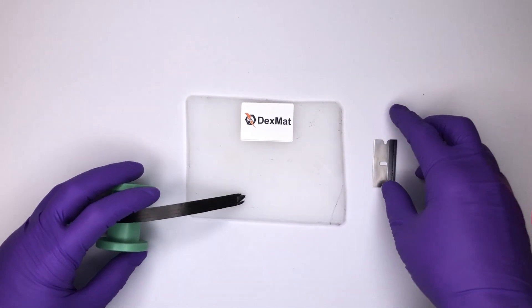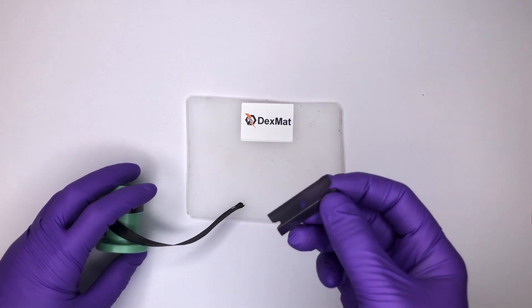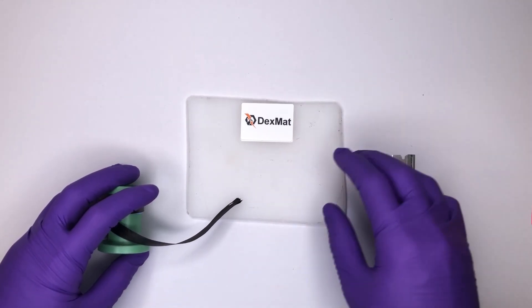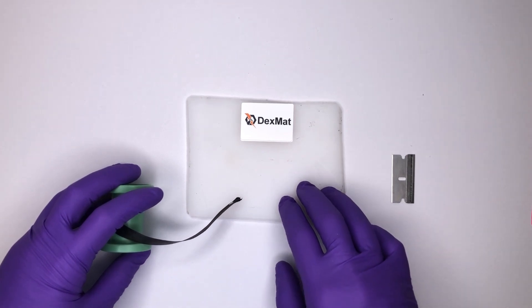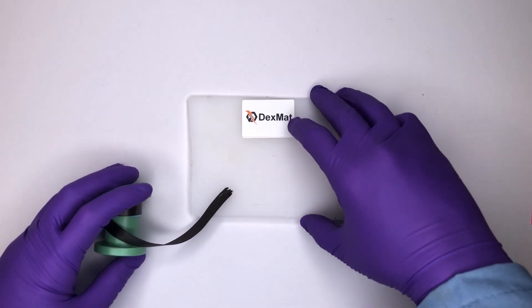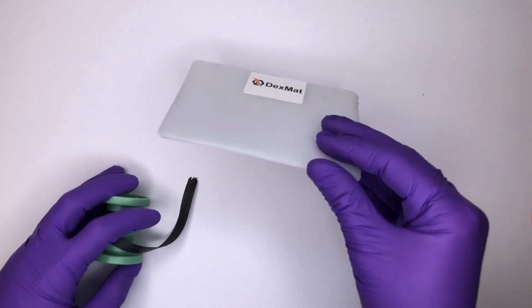It's rather tough. The best method that we've found is to use a sharp razor blade and to have a surface that has a bit of give to it, or into which the razor blade can indent, such as thick paper or, in this case, just a sheet of plastic.